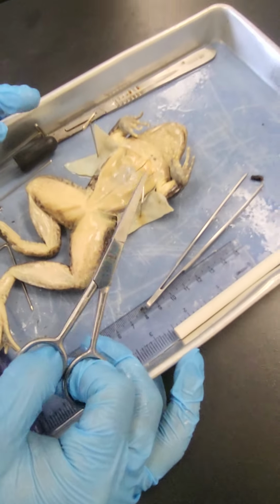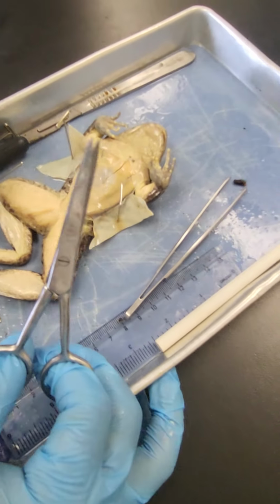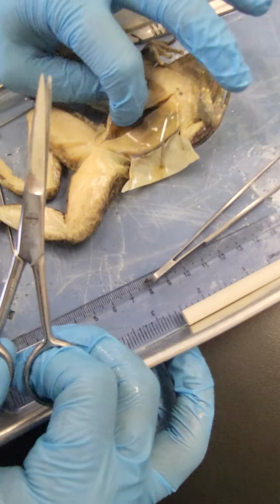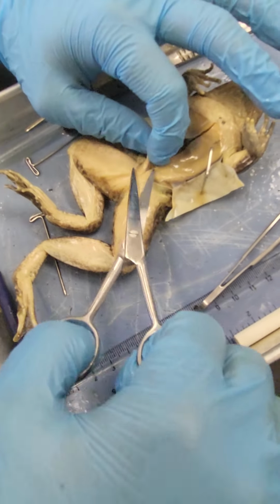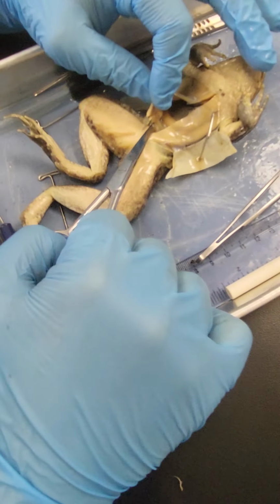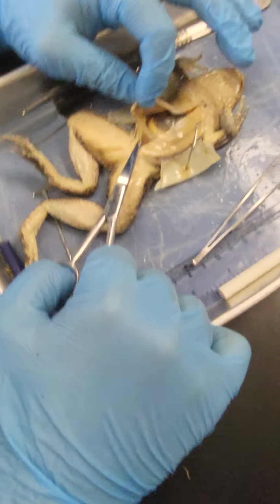Wait. If it's a female, it might be filled with eggs. Sophia, you alright? Are you sure? Cut the center. Cut the center. You're gonna have PTSD. Wait, you can cut the skin flaps off. You don't have to pin those. You are taking out organs.